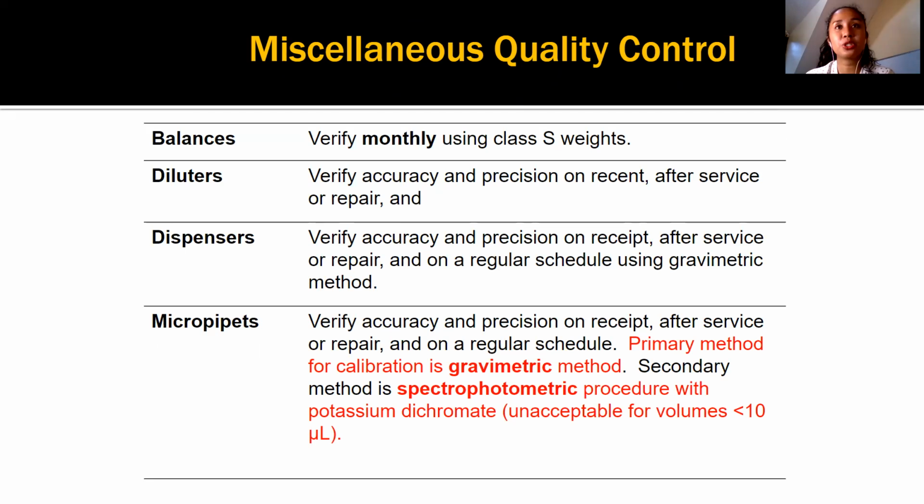So class, miscellaneous quality control. So how do we calibrate your micropipettes? So ito nasa QFR nyo, basahin nyo.